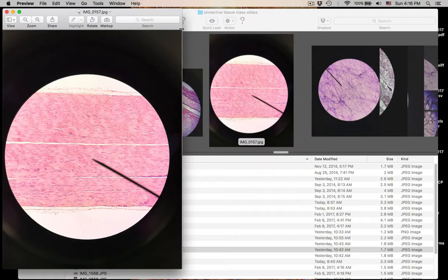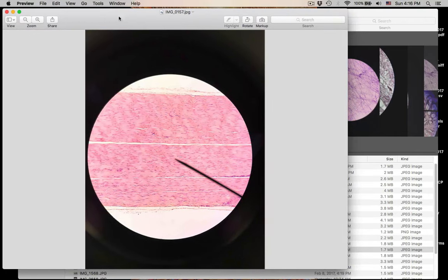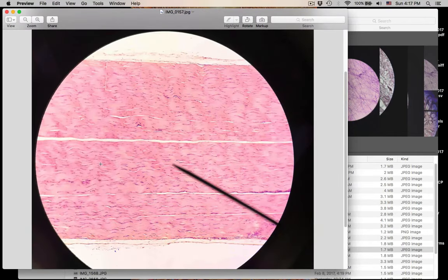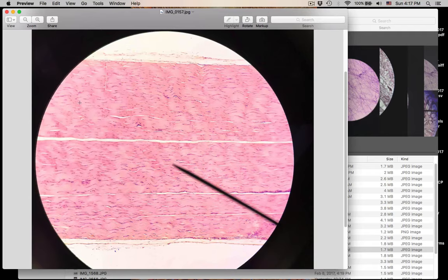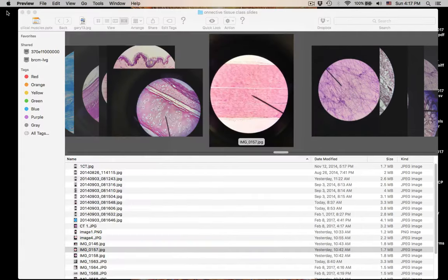Once again you see this connective tissue — the collagen is arranged in a nice parallel fashion. Where do you find it? Tendons and ligaments. Dense regular connective tissue. That was number fifteen.